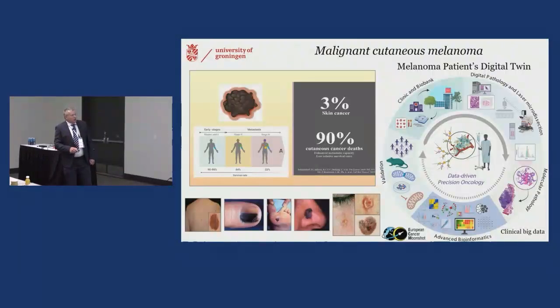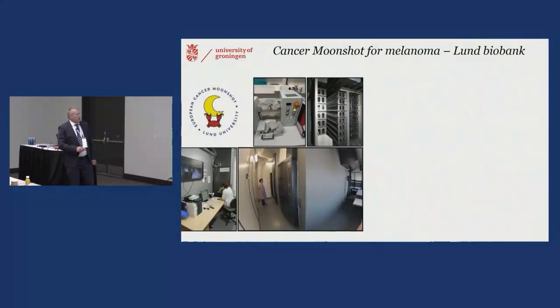This is called the Cancer Moonshot, and the initiative belongs to the US-started Cancer Moonshot program, focusing on different aspects of melanoma. At Lund University, the central core of this initiative, there's a very large biobank, which you can see here, an automated, -80 biobank.